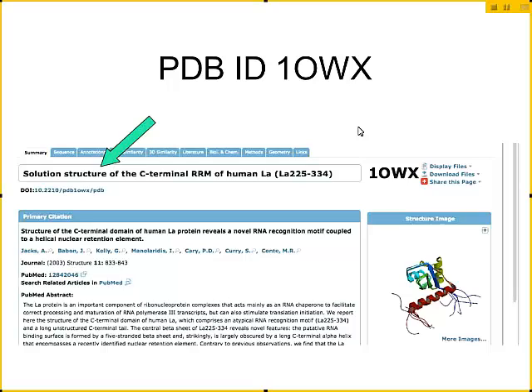If I'm doing a thorough job, I will actually compare the two biological units. And then I will look to see where the differences are. Now in some cases there are loops that are making contacts to other molecules. And so loops far away from the active site may be slightly different. But if they're far away from the active site, I don't worry about that. If there are changes close to important areas of the molecules, then I have to figure out which of these is more native-like. And then you may go read the paper. You may find, for example, one of the structures I'm working with now, one of the biological units has the ligand bound and the other one does not have the ligand bound. So then I'm going to take the biological unit with the ligand bound.